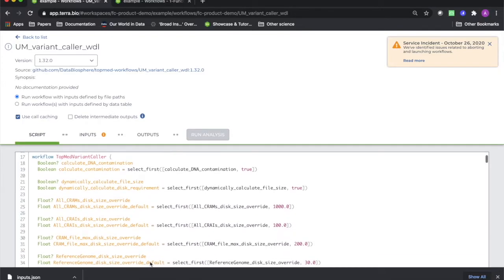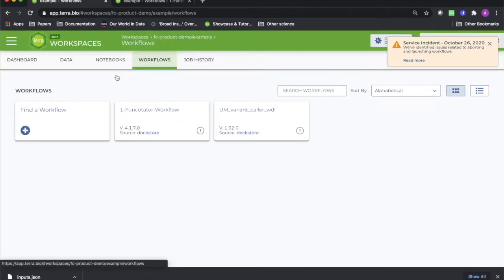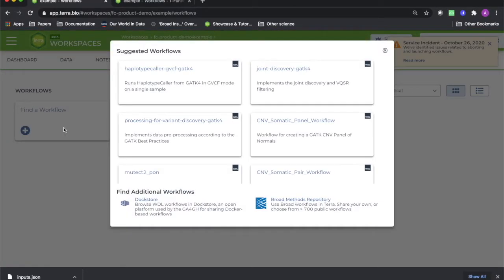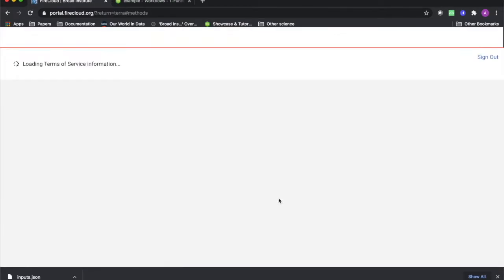To do this, begin by clicking Find a Workflow in the Workflows tab, and then clicking the Broad Repository link at the bottom right of the popup.